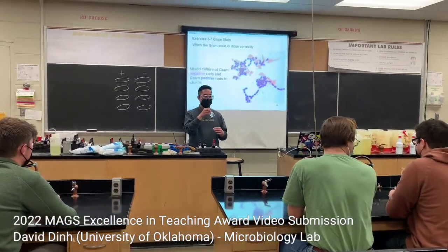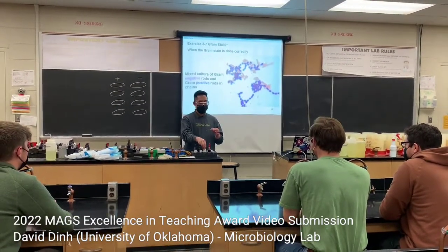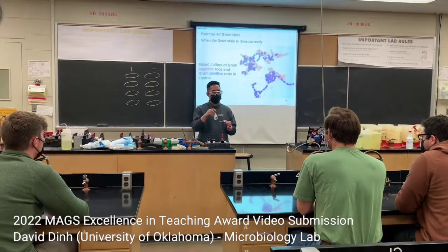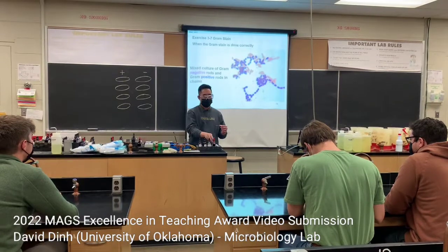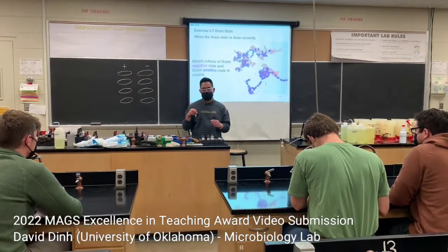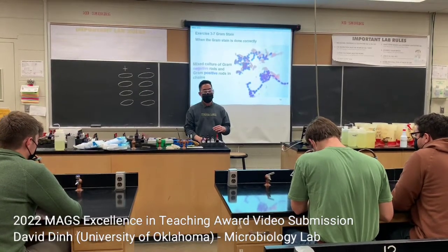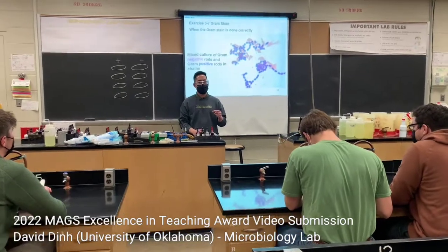Ethanol? Ethanol, yeah, so that's the decolorizer, right? So that will remove the gram-negative outer membrane. And that should be less than 5 seconds. You shouldn't do that too long, because then you can over-decolorize. And then you rinse with water, then add the last stain, which is the counterstain safranin, and that will be the last step. Let it sit for 1 minute, rinse with water, and then blot it dry, and then we'll look under the microscope.